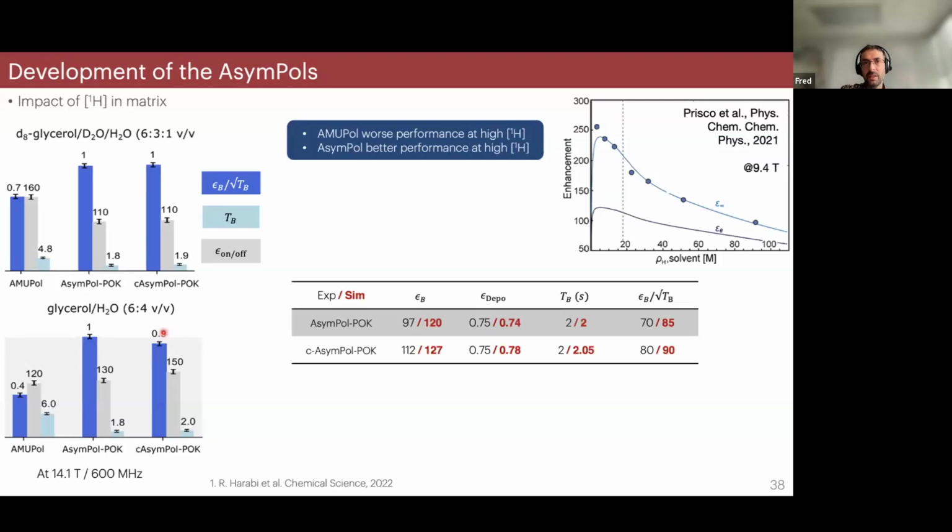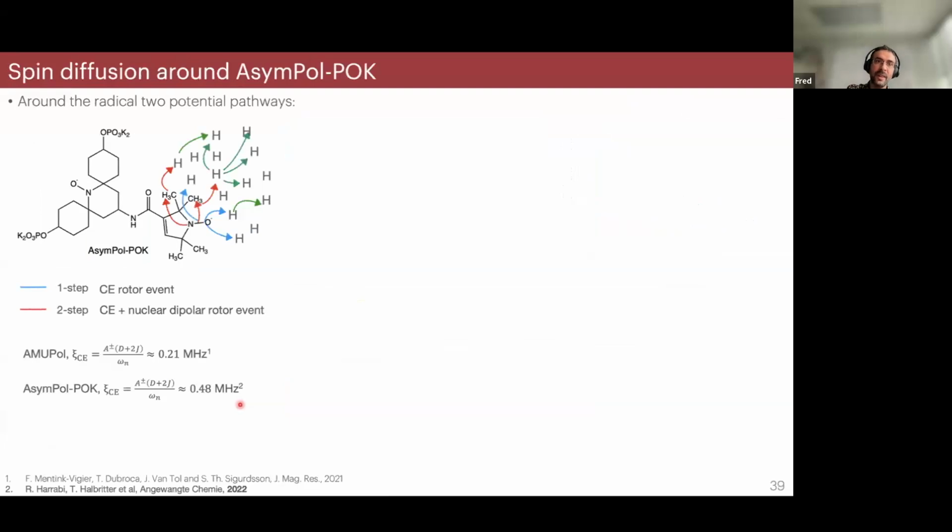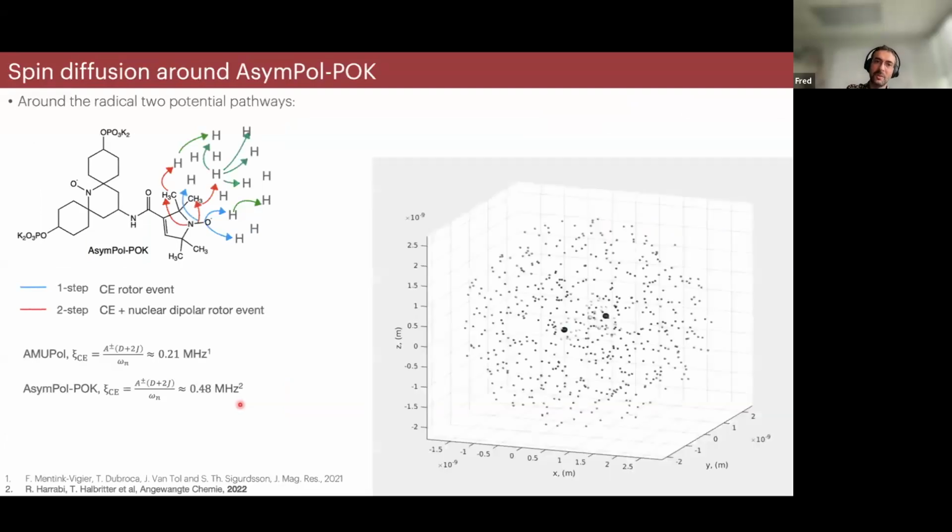With the DFT and MD simulations and EPR fits, you can predict the enhancement and the build-up times, and the simulation works. So you can go one step further and see, okay, what's happening around those radicals? Because if deuteration is affecting the DNP, there is something to dig. I will go quickly. As mentioned, you can do the simulation and look at how the spin diffusion works around the radical now. And this is how the polarization builds up around the biradicals. In white, those are the protons on the molecule, and in black, the protons around the molecule.